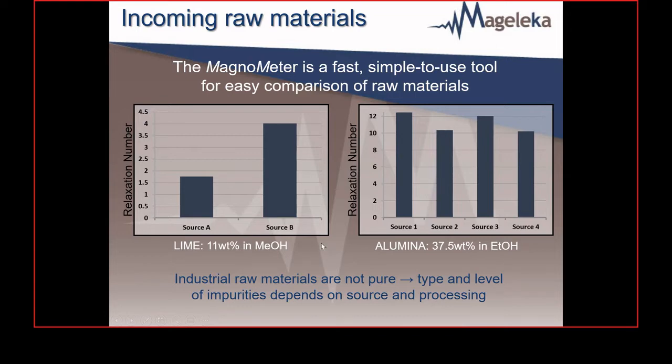As I said at the beginning, you can use almost any concentration, but the sweet spot for NMR relaxation measurements really is somewhere between 10 and 40%, because typically in those cases the suspensions are flowable slurries. The maximum concentration that I've ever measured personally is a 91% silver paste, and to get that in an open-ended NMR tube provides a little bit of difficulty, but it can be done. But in this case, going back to the lime, now there's a significant difference between the two materials.